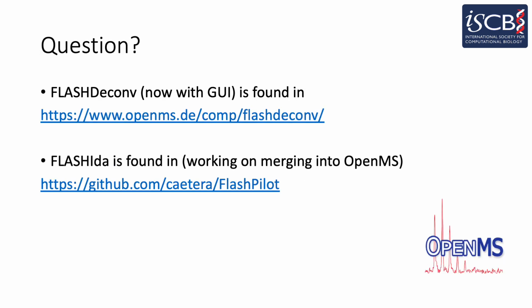FLASHDeconv is a part of OpenMS software, and FLASHIda is freely available from the GitHub site.